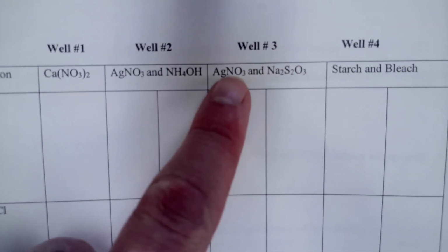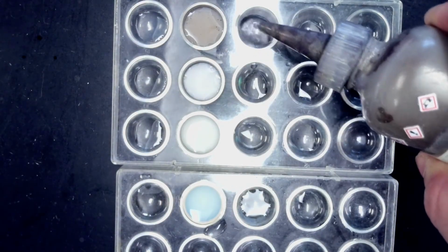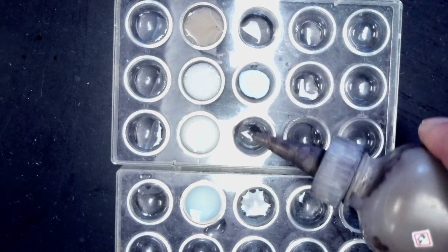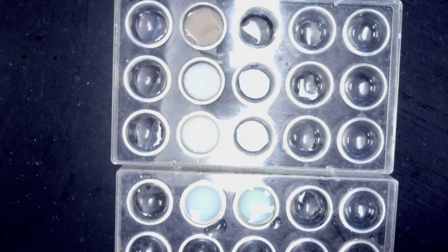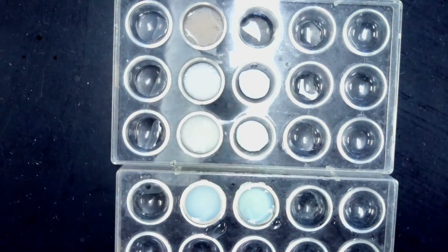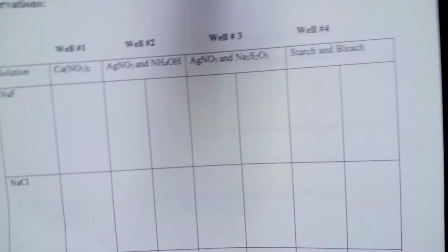Okay, now we're going to do well 3. We're going to add silver nitrate again. So we should have the same reaction as well 2 because we're adding the same thing. So you can see the 2 white precipitates, the creamy one. I'm not sure why the top one didn't turn brown. It might just be because it's a black background, harder to see.